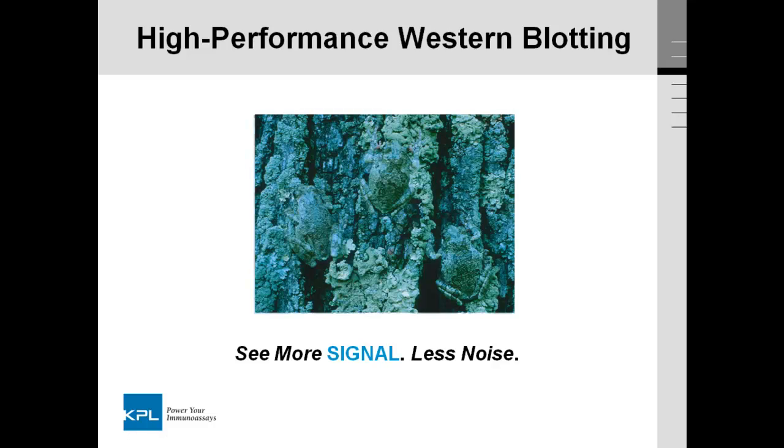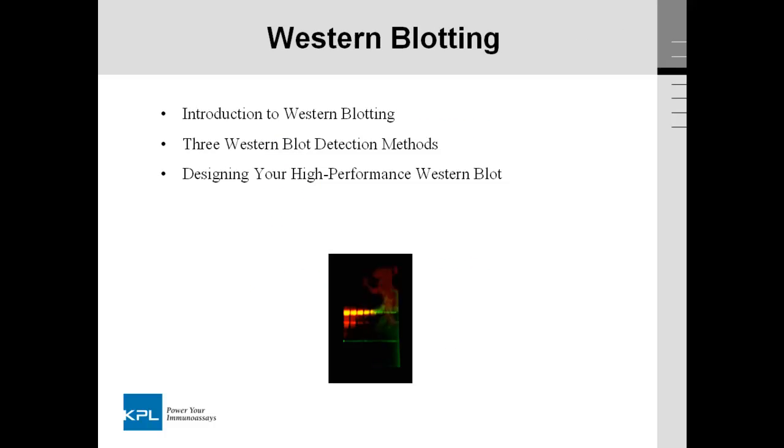Hello, thank you very much for joining us today for our webinar on high-performance Western blotting. We hope by the end of this, we have prepared you with the tools to see more signal with less noise. Today's webinar will cover the following topics: an introduction to Western blotting, 3 different Western blotting detection techniques, and how to design your high-performance Western blot.